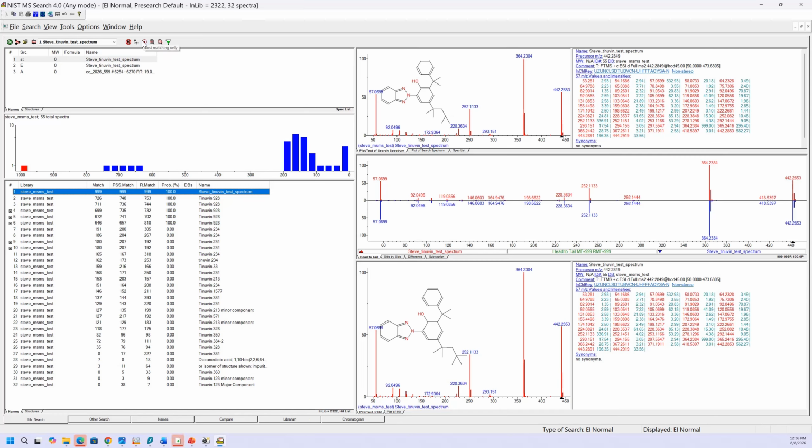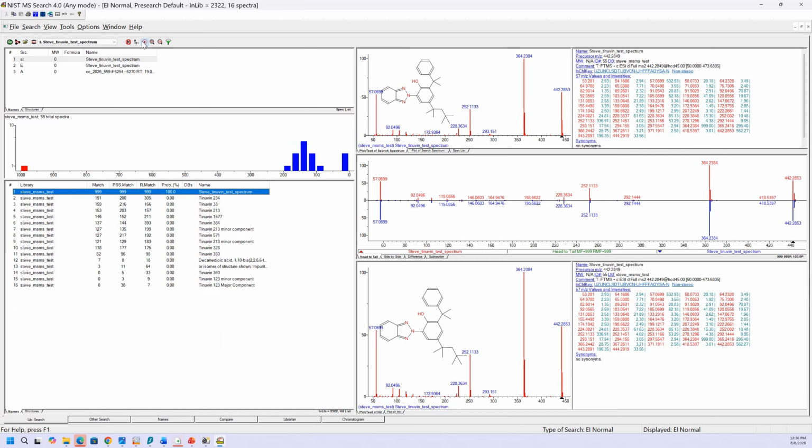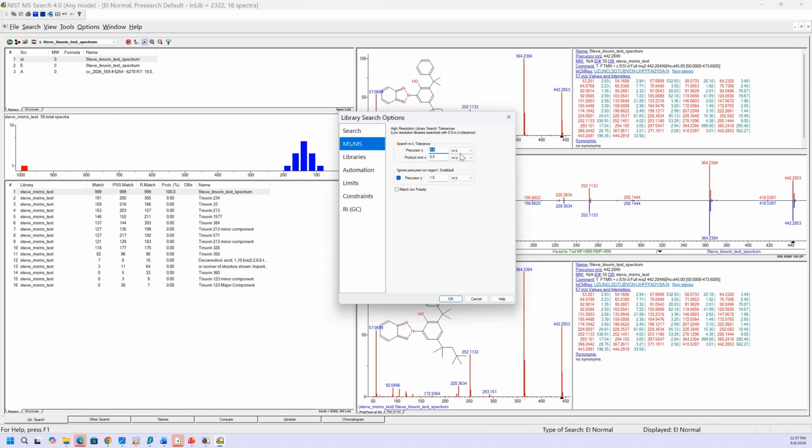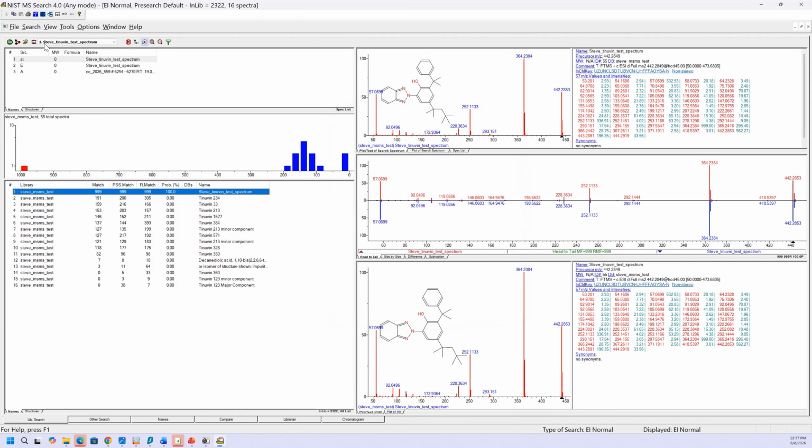And you can get rid of the replicates here if you want to. A lot of replicates in the library of that. So I didn't know, maybe you just can't do that, use these filters. Maybe I misunderstood. At one time, maybe you told me I needed to use parts per million. So I think I tried 400 parts per million. I don't know what really I need there. Thought that was enough to get it within the window, but maybe not. I'll try that for starters, just for fun, and go.